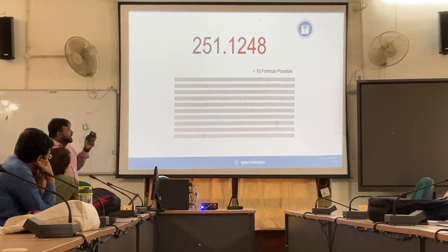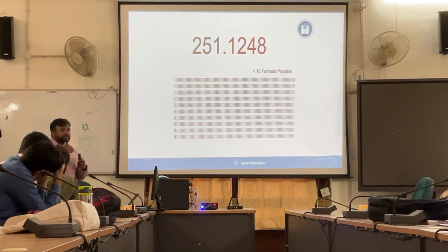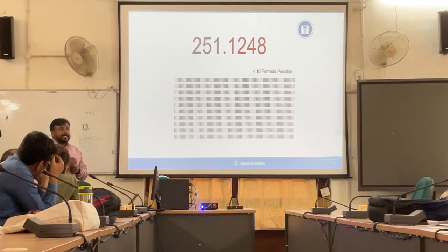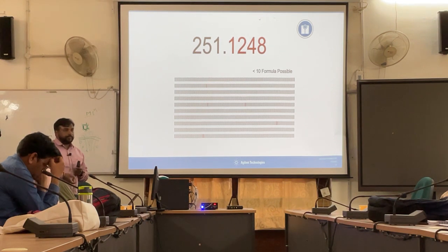So the same way we have explained. Now, as we increase the accuracy, we are reducing the ppm error and getting fewer possibilities for the compound. With the help of this, we can actually target the compound of concern and get more meaningful data.